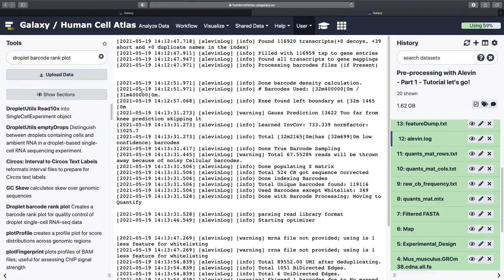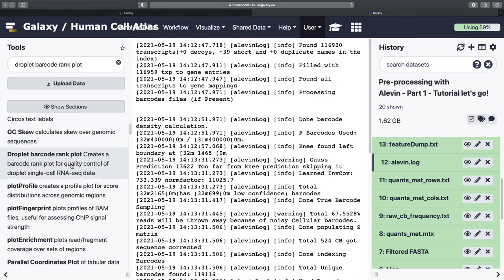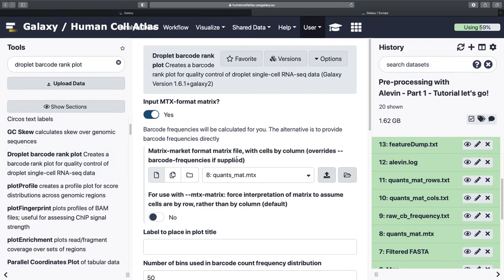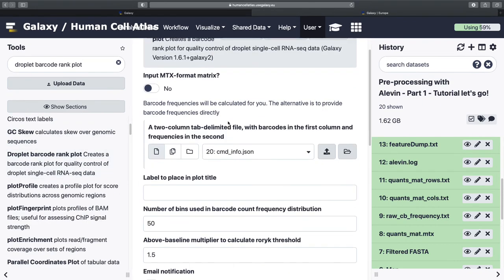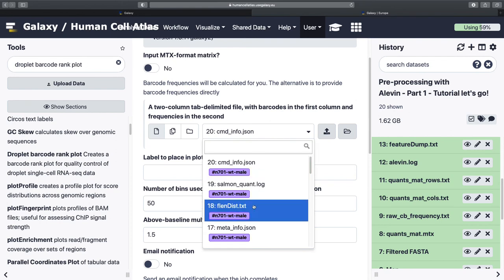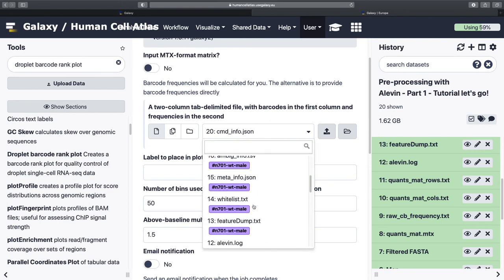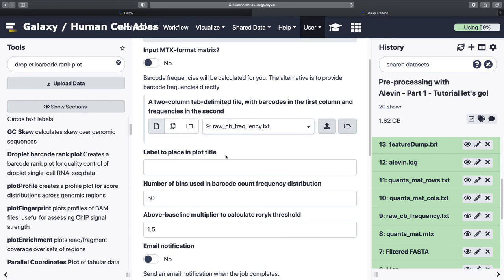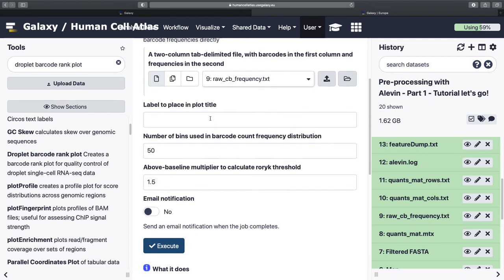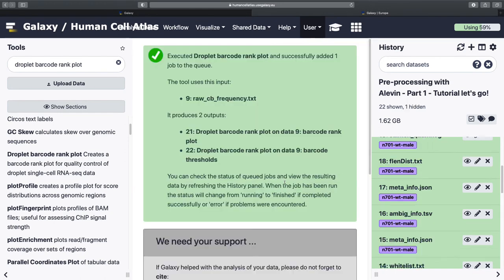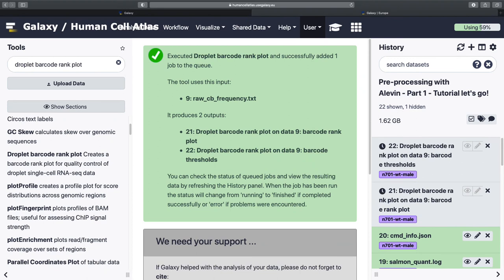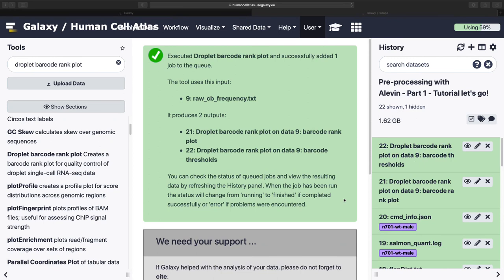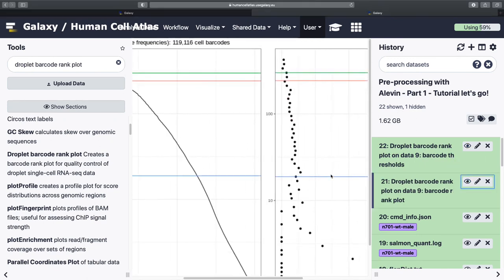And I should be zoomed in. There we go. So we want our droplet barcode rank plot. Not in that format. Raw CB. You can see. Cool. This is very good. Remembering to label a plot. I never remember to do this in Galaxy. This is some excellent data management technique right there. And we can look at our lovely barcode plot.